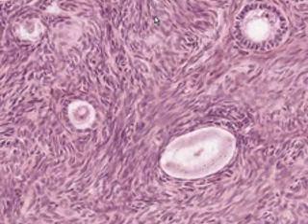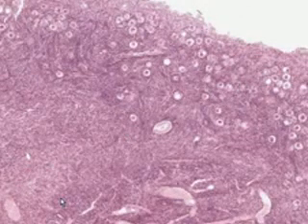And notice there are a lot of generally spindly or stromal cells between these follicles. And the more closely you get towards the medulla of the ovary or away from the outer cortex, the more stroma you will have. There's relatively little stroma here, and there's a lot here.